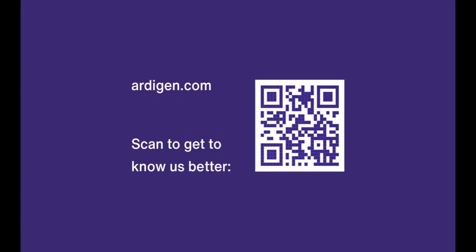That was a brief showcase of the capabilities of Ardigen phenAID, the most convenient way to use artificial intelligence in drug discovery. The application is fully customizable to meet your specific needs. It supports deployment in the cloud or on-premises. Our team is actively developing new modules to enhance functionality, including hit identification, lead optimization, library design, and more. Additionally, we provide data analysis as a service, and our latest models are already available for analysis of your data.